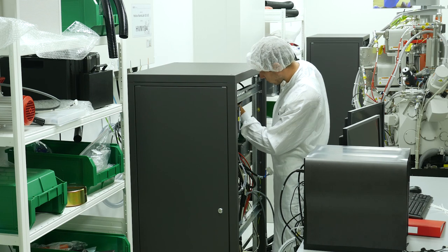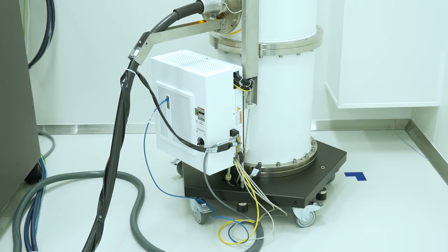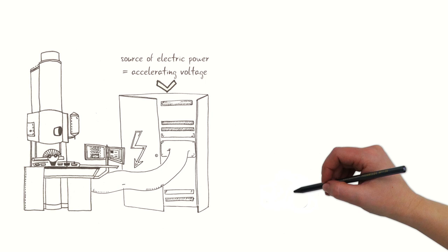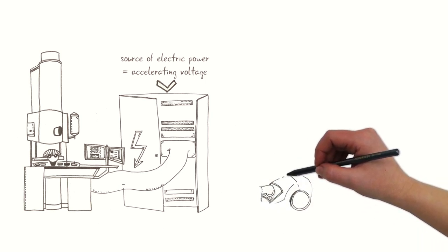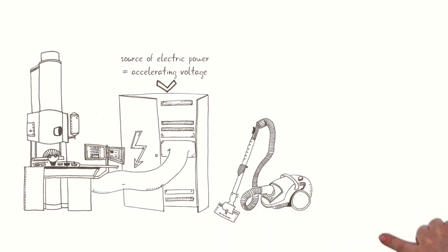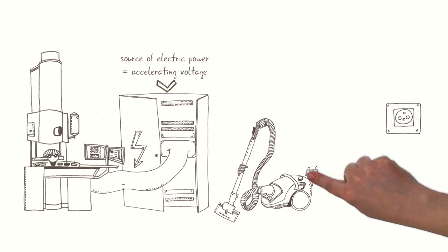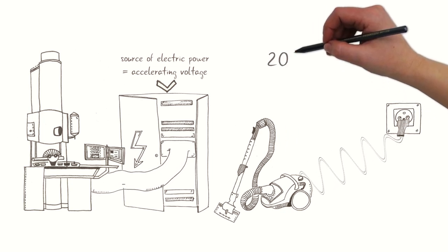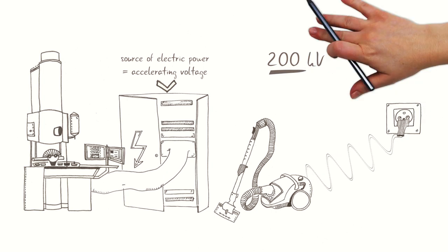The power cabinet contains a number of sources whose output voltage or current fluctuate not more than 1/1,000,000th of the output value. I probably understand, but don't you have another example? The one with tennis was excellent. I do. Try to imagine that the allowed voltage fluctuation in a common socket has the height of Mount Everest. Then, the allowed voltage fluctuation of a 200 kilovolt high voltage source has the height of only 7 centimeters. Such stability needs very efficient and sophisticated electronic circuits. You see how good you are with examples?